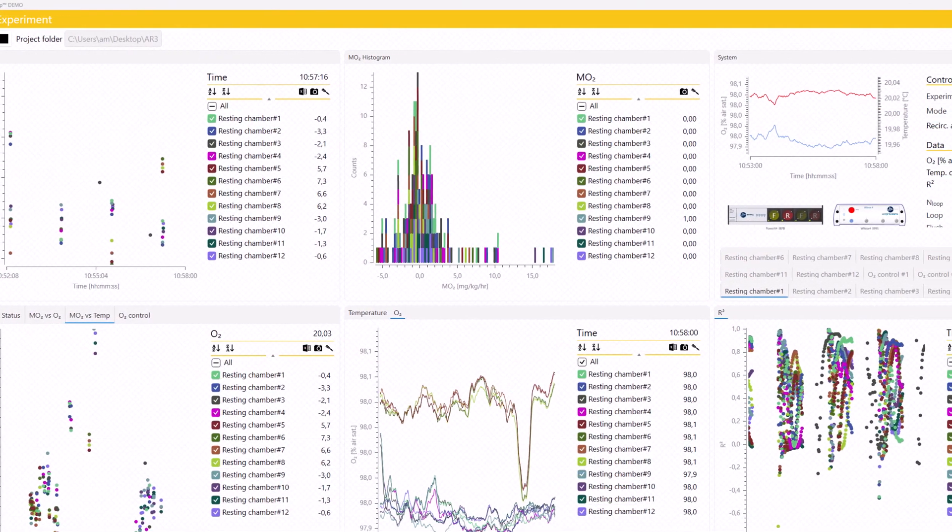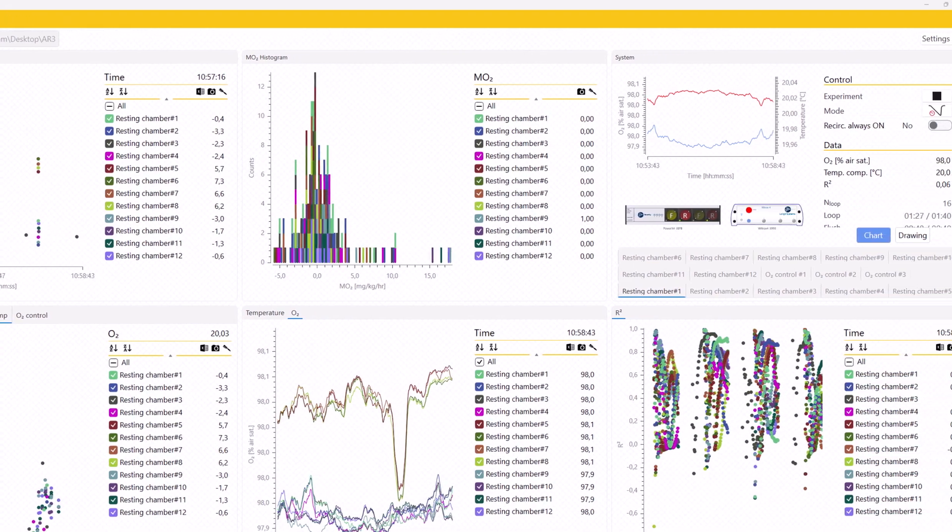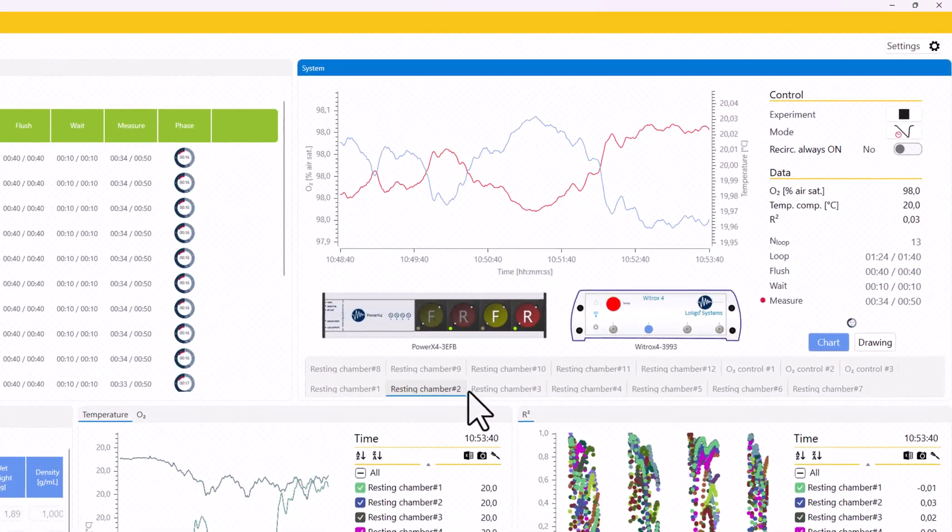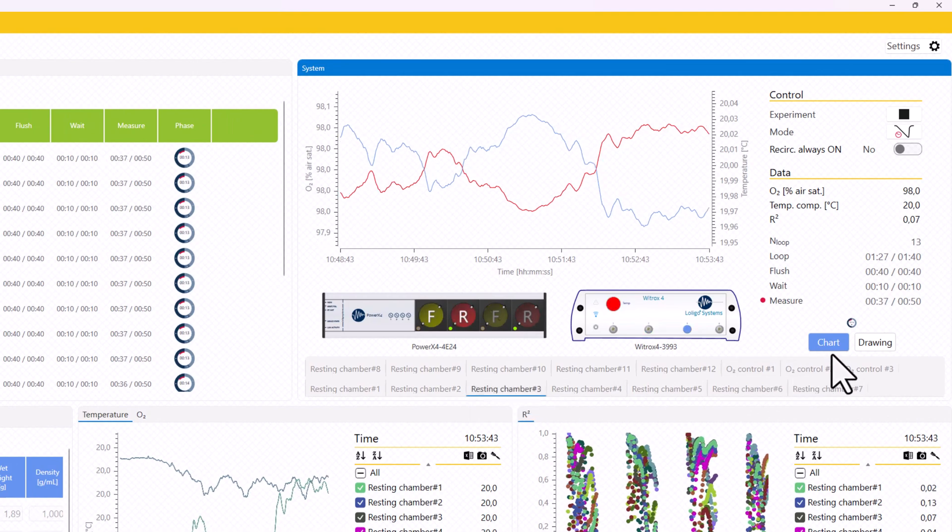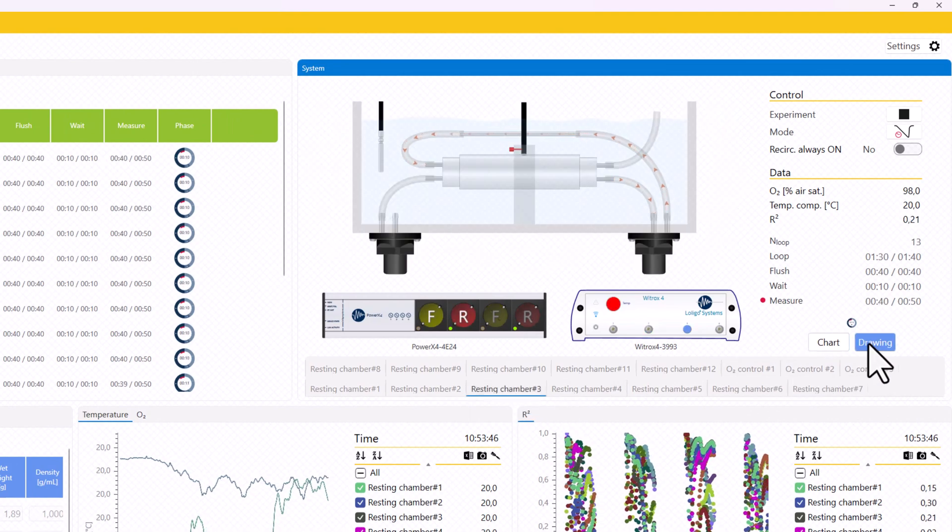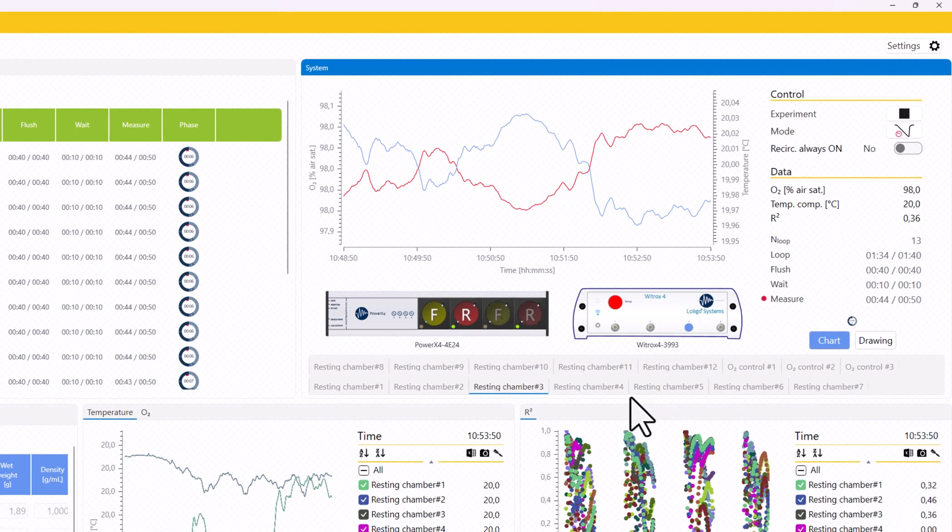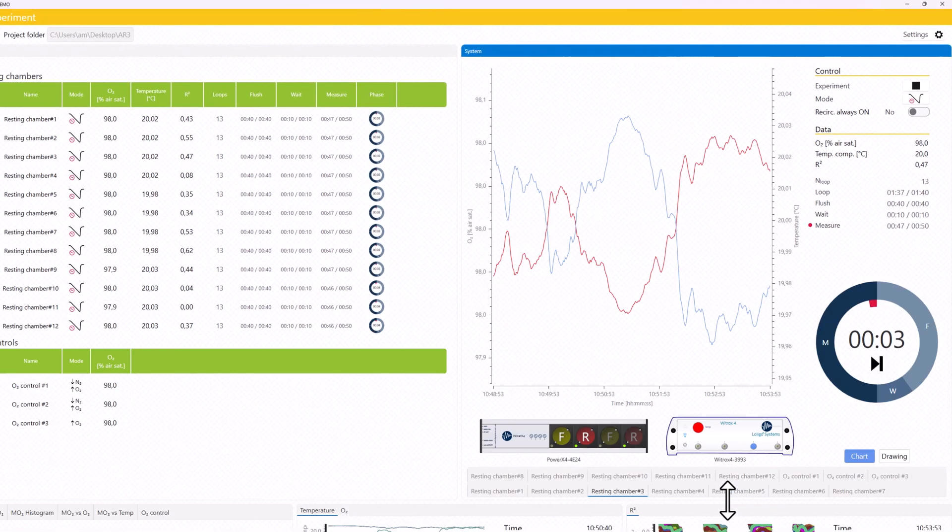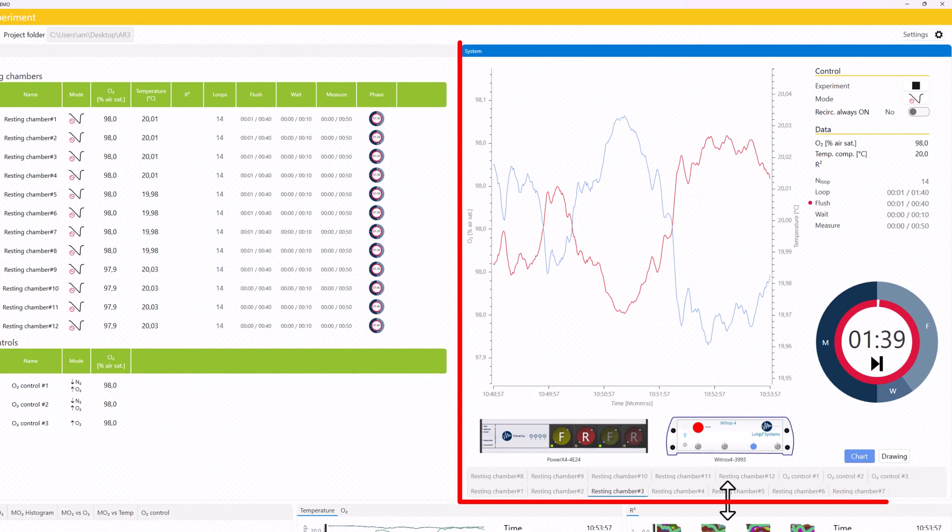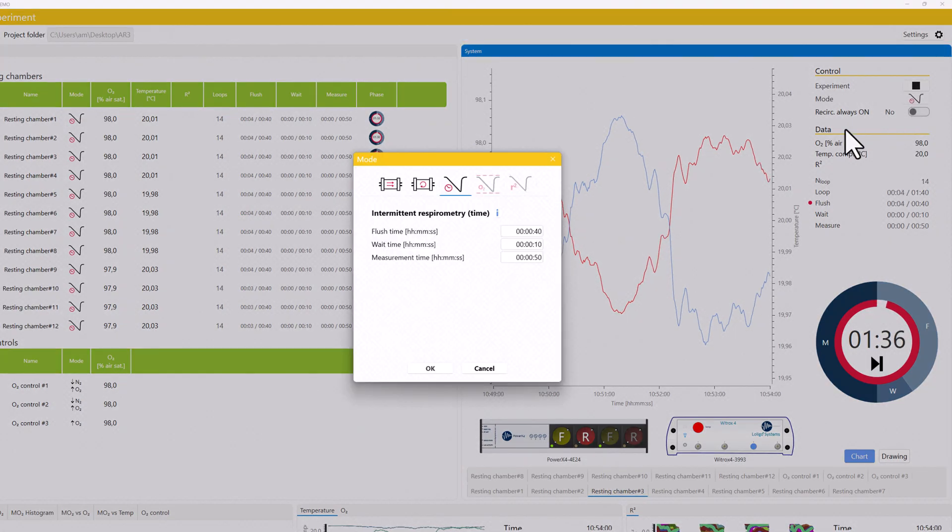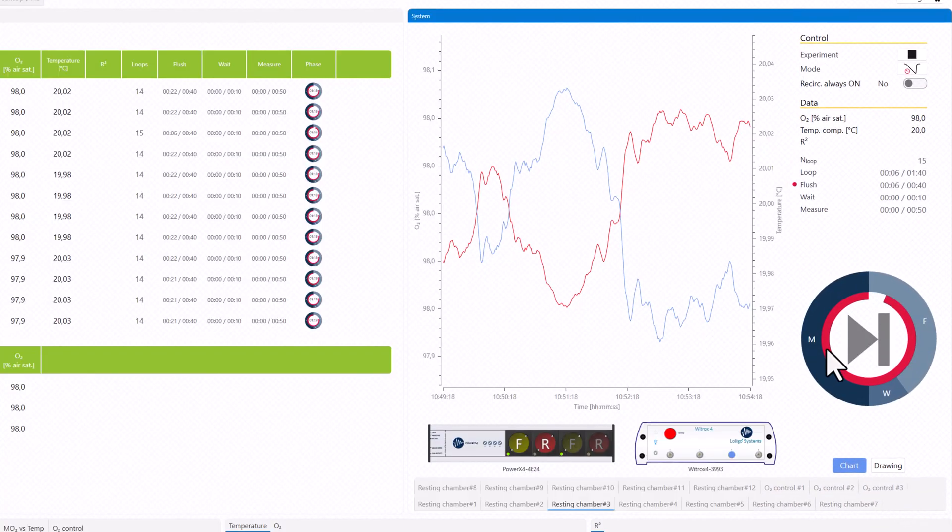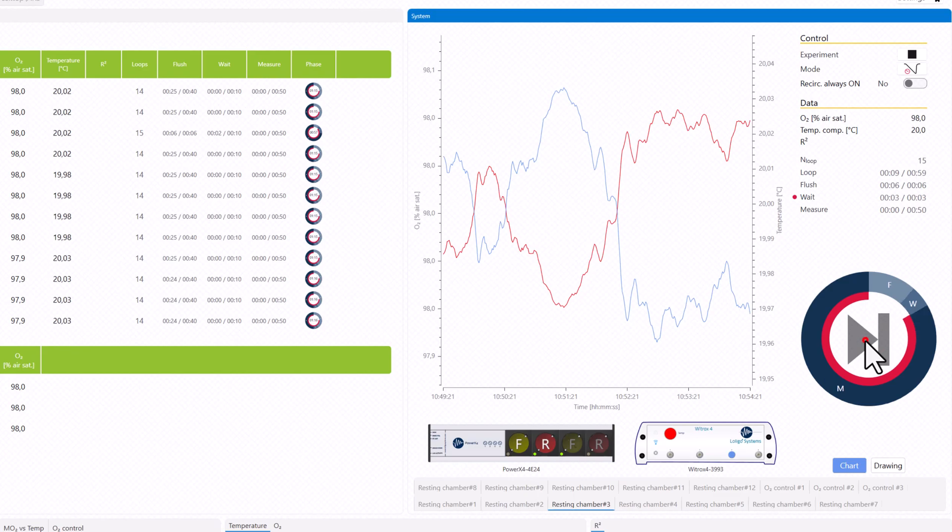Autoresp3 is centered around high-throughput data collection and independent control of each chamber. Multi-channel setups can be monitored and controlled in real-time. Each setup also has a dedicated system tab showing you vital information and control options throughout the experiment. And the new phase meter helps you keep track of each phase in each setup.